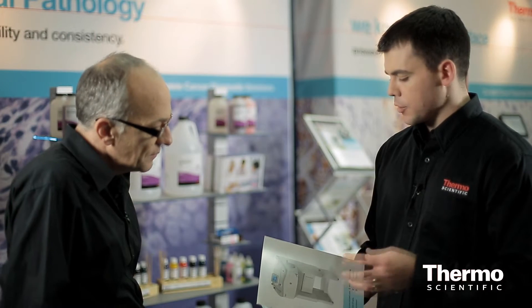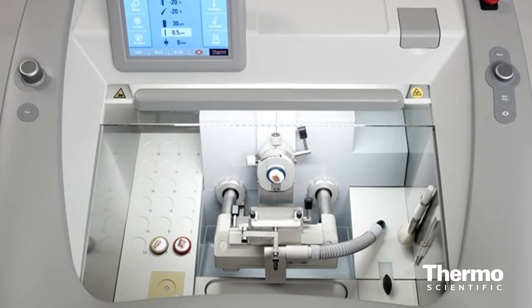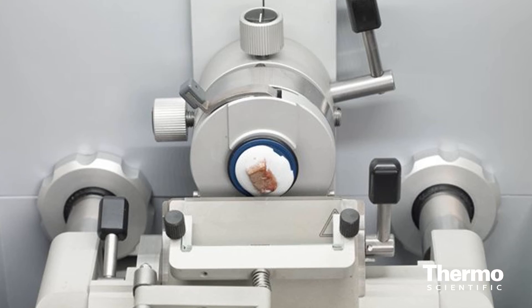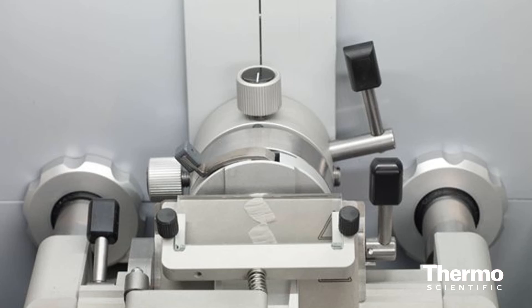One of the really unique things that allows the cryostat to use a lot less energy but also get much higher quality sections is the way the temperature is controlled in the unit. Instead of blowing cold air across the sample, this cryostat actively cools both the specimen head and the knife. That way it allows the temperature to be changed quickly to the optimal cutting temperature of that sample, but also maintains your set temperature easily. Cooling just those two areas allows it to be a lot more efficient, using about half the energy of other available systems.